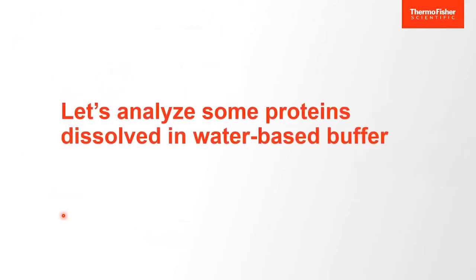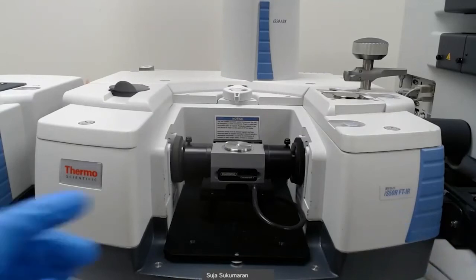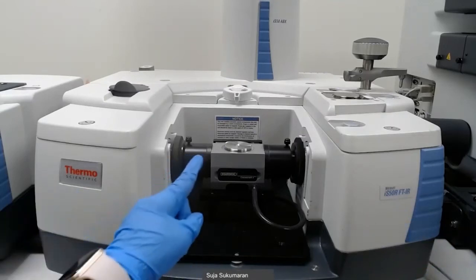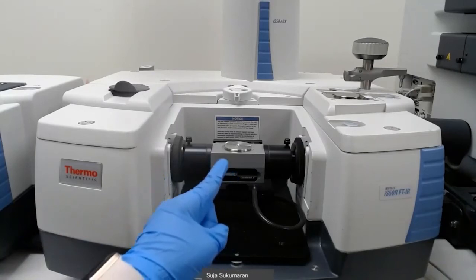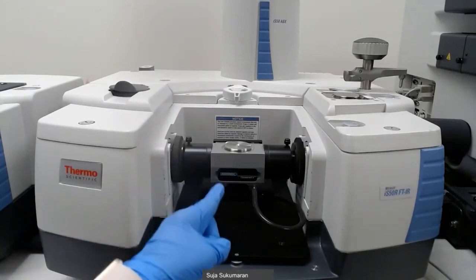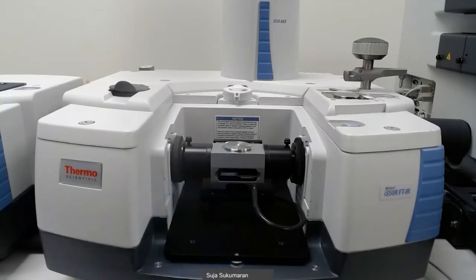So let's analyze some proteins dissolved in water-based buffers. What we are going to do is use the IS50 FTIR to do our measurements for today. What you can see in the main sample compartment is my multi-bounce ATR. This is a 10 bounce diamond ATR.